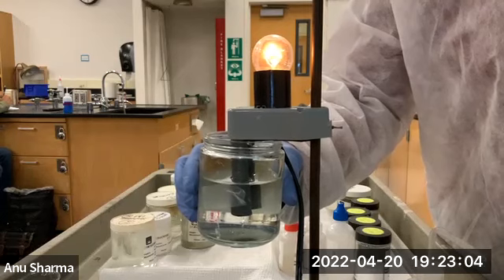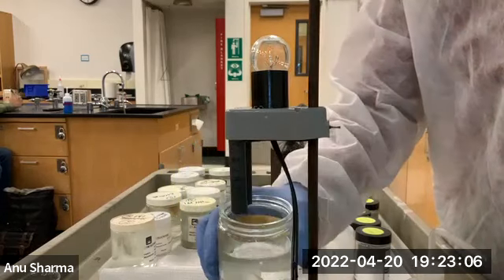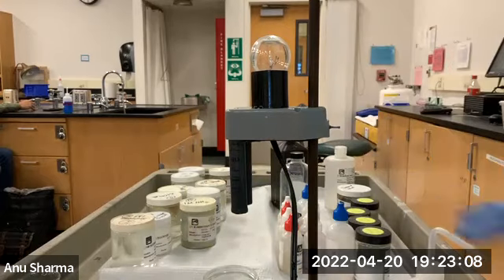Weak electrolyte, less dim. So here you will see the major species is C2H3O2H, the hydrogen is still intact. That is still the major species. The minor species are the ions. And the ions are C2H3O2, 1 negative charge, and a small amount of hydrogen ions also. So these are the minor species.